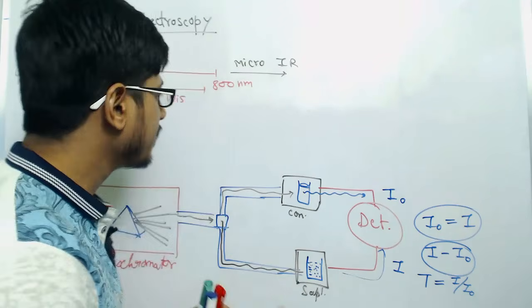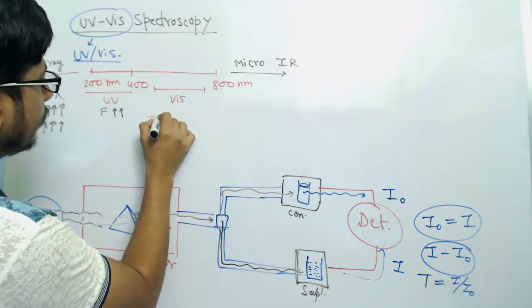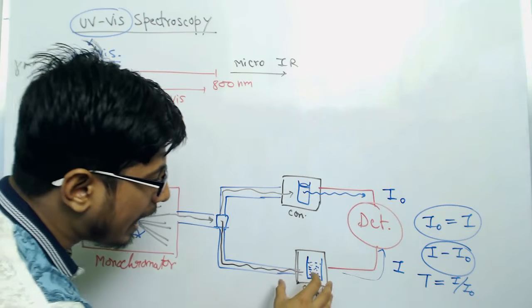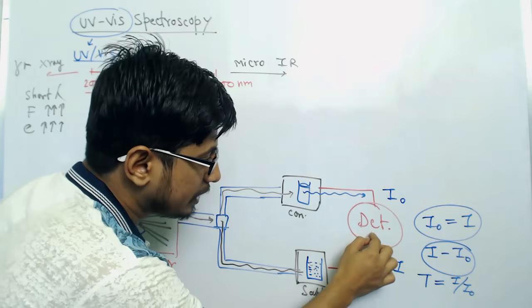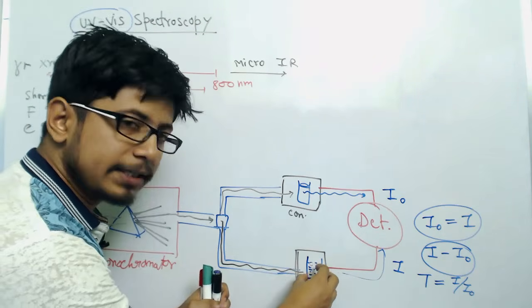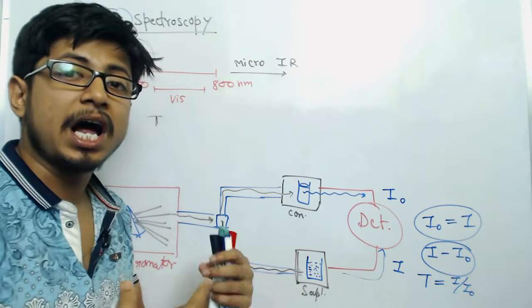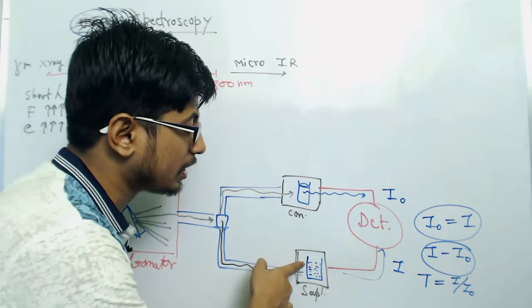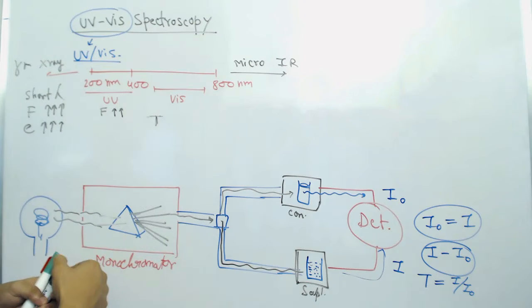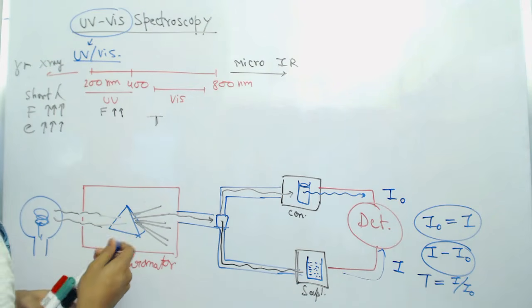But how exactly? Because if you look normally at this data, they are not going to give us absorbance as a value, because the detector detects the transmittance, right? Absorbance is there in the sample and the detector only detects how much is transmitted, how much passes through this cuvette to the detector. So always the value that we'll get will be in the transmittance form.